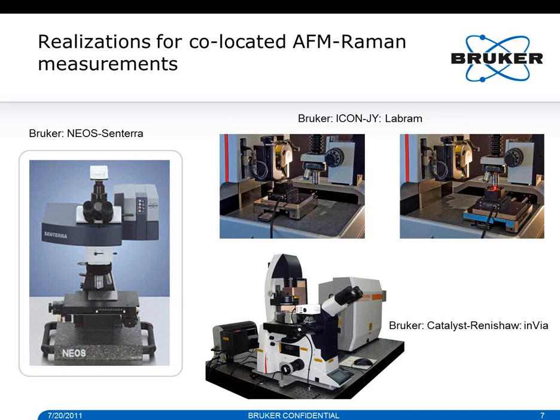And vice versa, there are AFM things which might affect the Raman microscope. So when you look into these co-localized solutions, you want to make sure that you don't just take two pieces and slap them together, but that it's done properly and that the specifications of both instruments are still there.